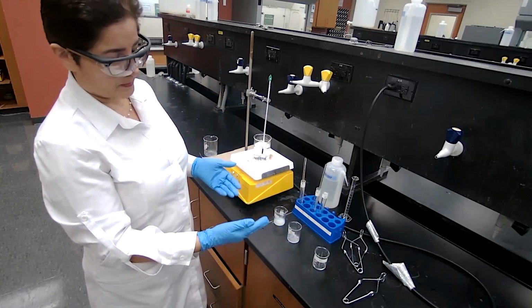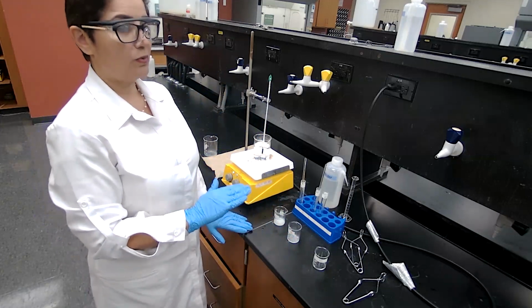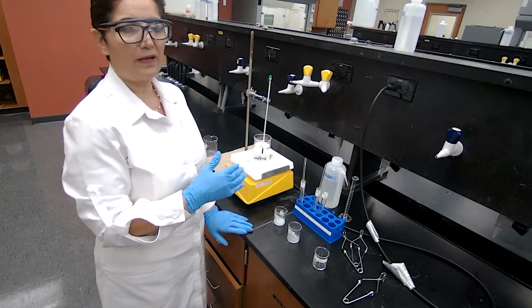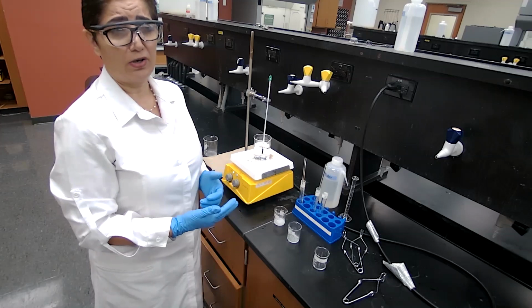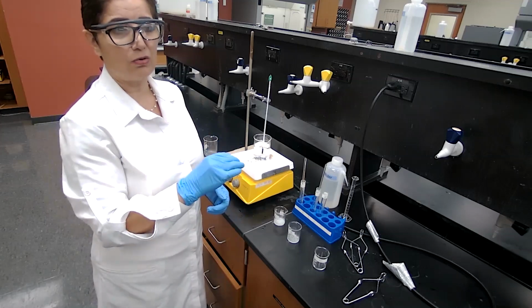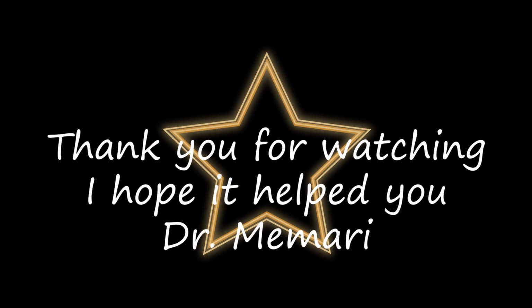So just make sure to do that part. So we are done with part 1 of the experiment. Going to prepare and do part B of the experiment, which is identifying an unknown acid based on the odor of the ester.